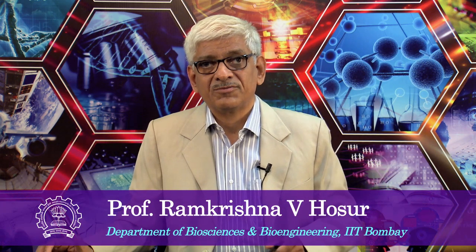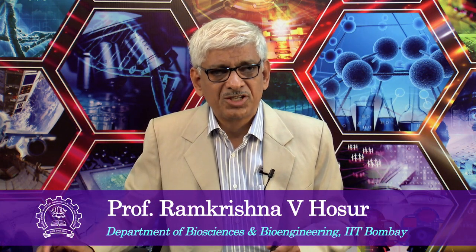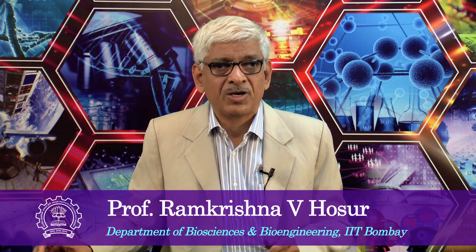So, these are the essential elements which have become important as a result of the Fourier transform process of spin excitation and data collection. We will stop here and we will continue with the further aspects of Fourier transform NMR and the features which are very specific to Fourier transform NMR in the next class. Thank you.